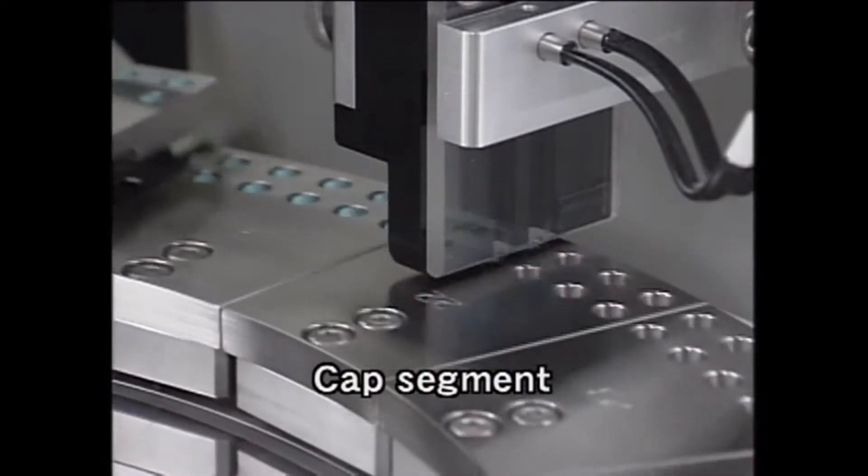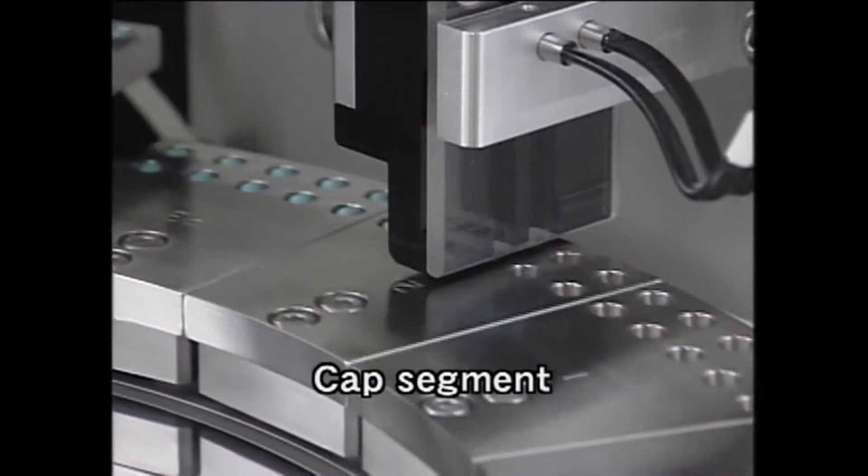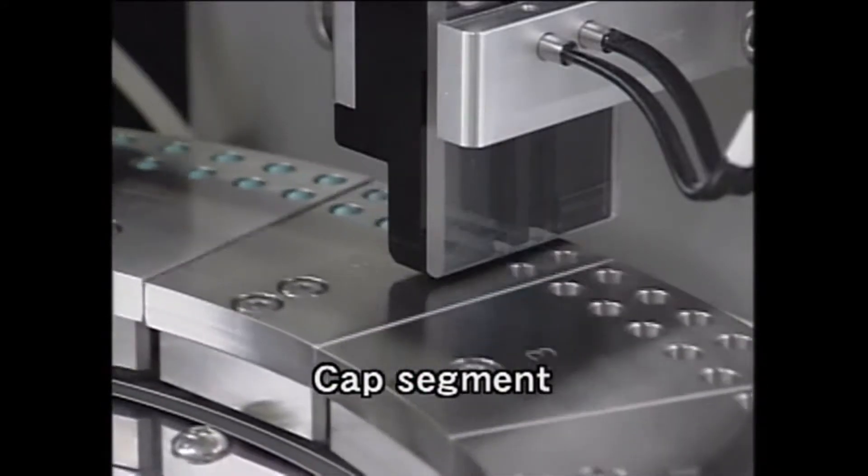This prevents empty capsules from being included by automatically removing the capsules that fail to separate into halves.